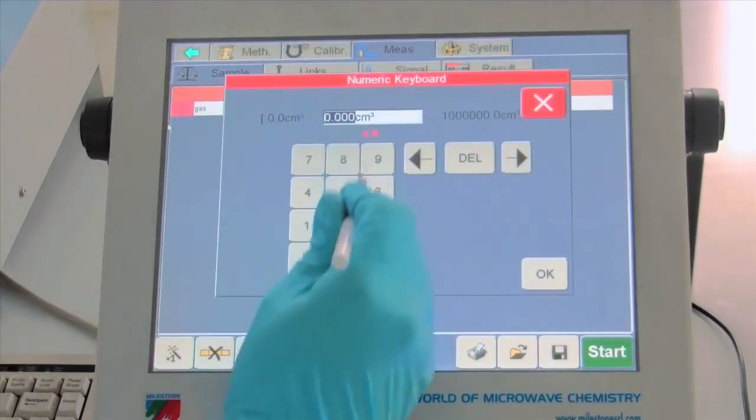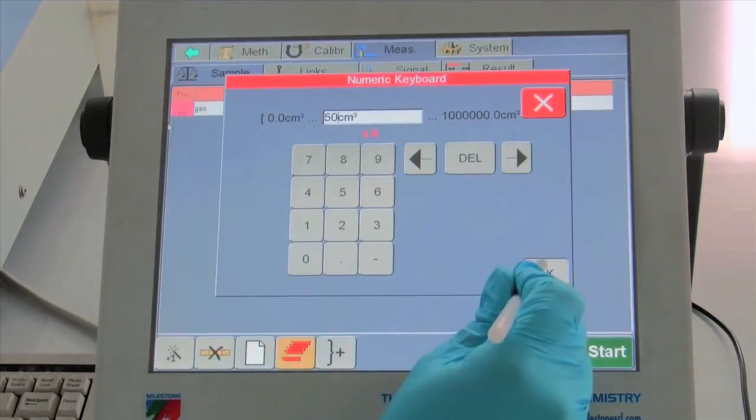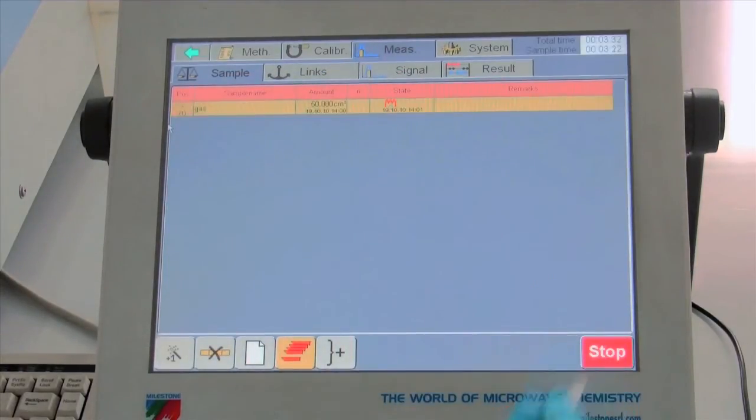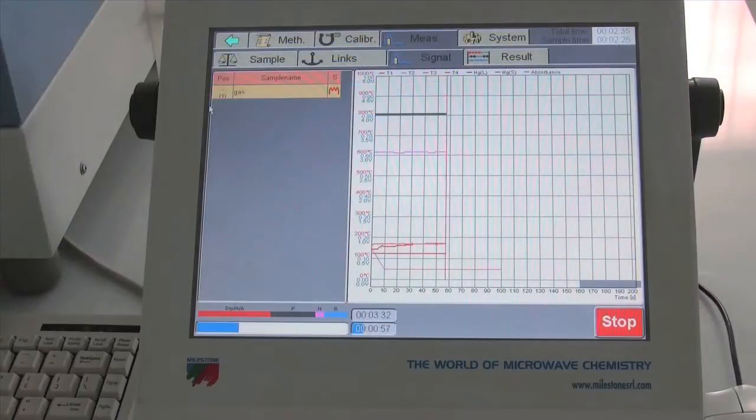EasyControl also has an automated blank check feature. Should an extremely high concentration sample be measured, it will run blank cycles until the blank returns to a user-defined level. A great feature for unattended operation.